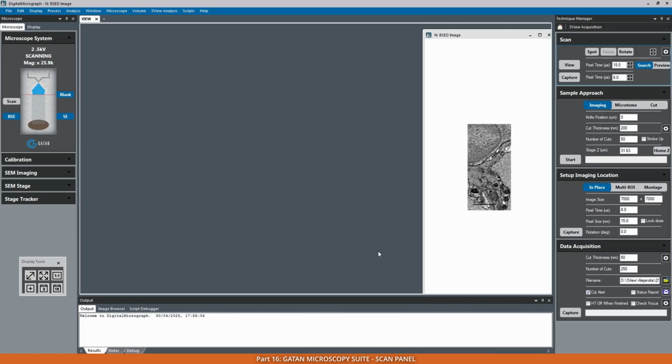Let's talk now about the widgets of this user interface. Unfortunately, I am not in front of the microscope, but in my office, because this screen capturing program I only have here. That's why I do not have access to these mechanical controls for zooming in, zooming out, focusing, and things like that. So I will be a little bit limited in doing quite quick operations.